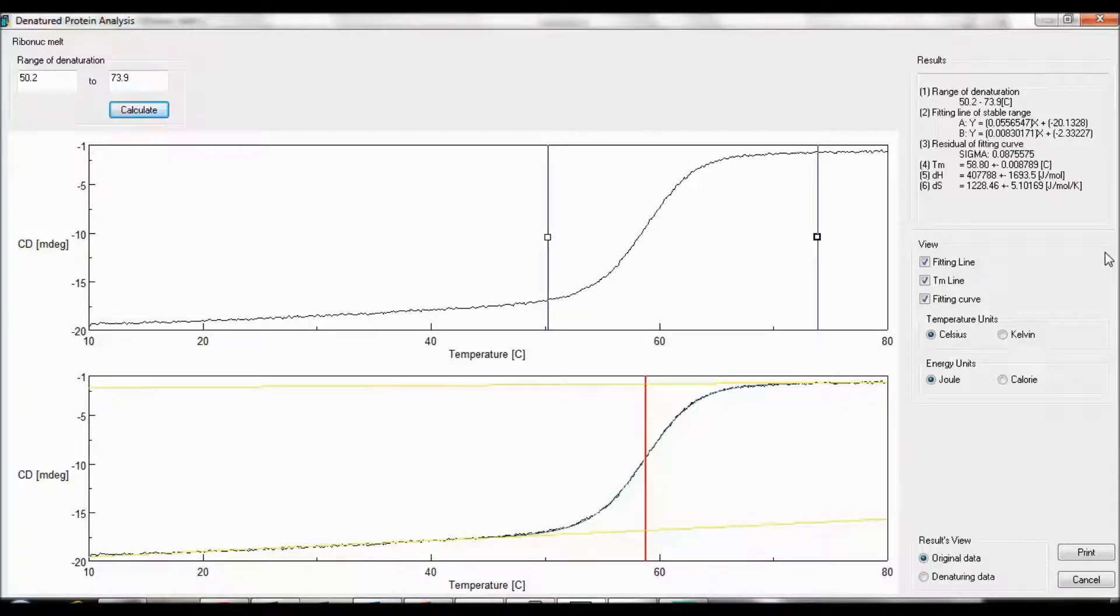The fitting line is the line of the stable range and are shown by the yellow bars. The melting temperature line is the vertical red line indicating the denaturation temperature. Confidence intervals can be obtained by selecting fitting curve.